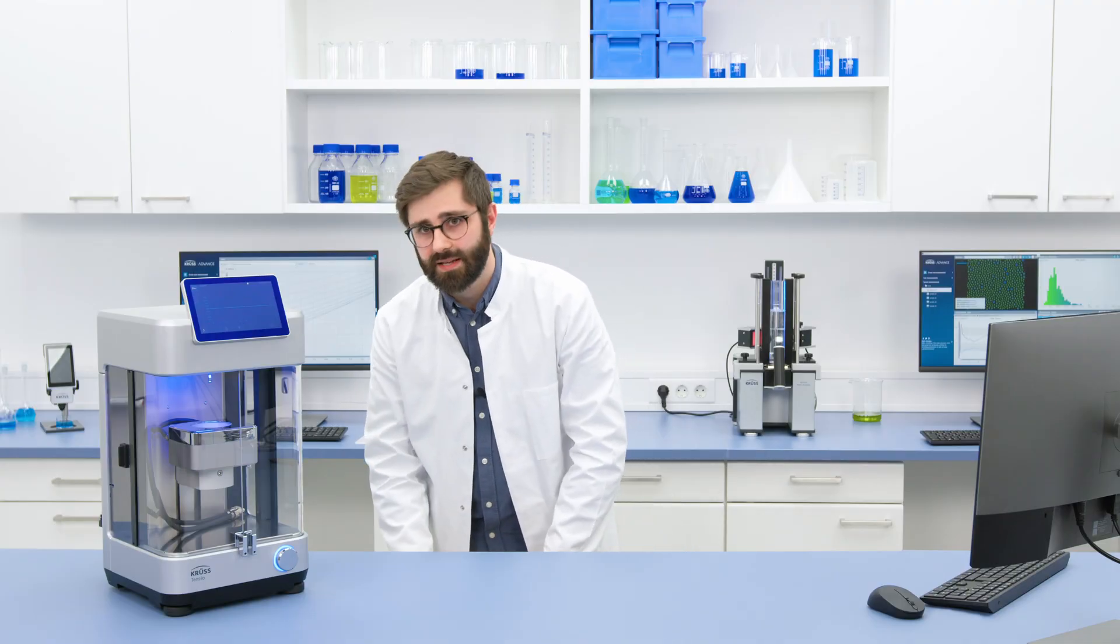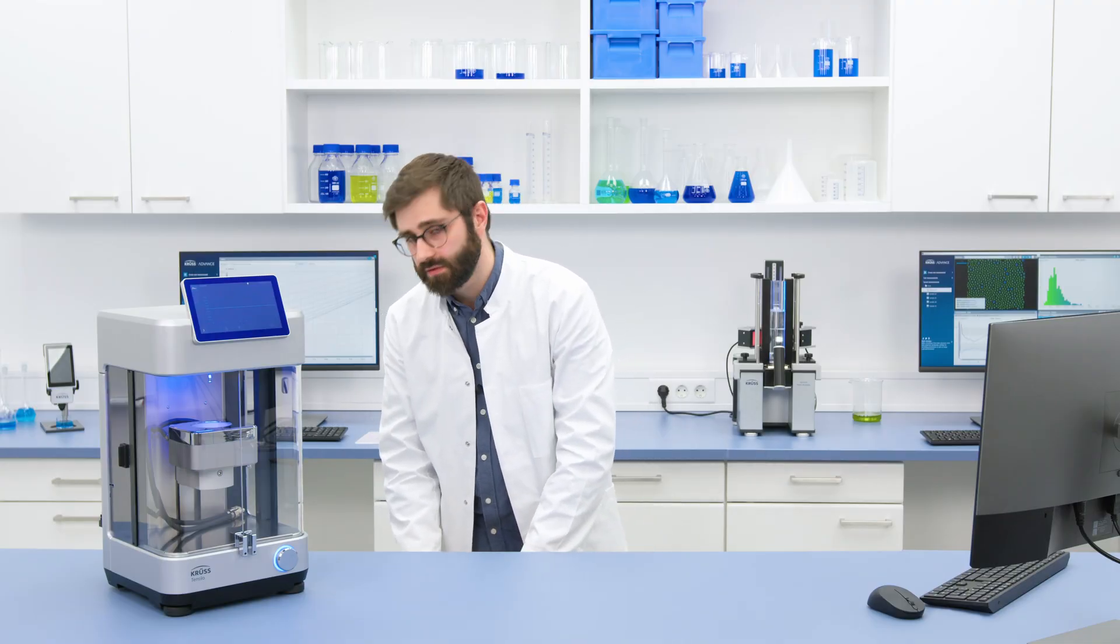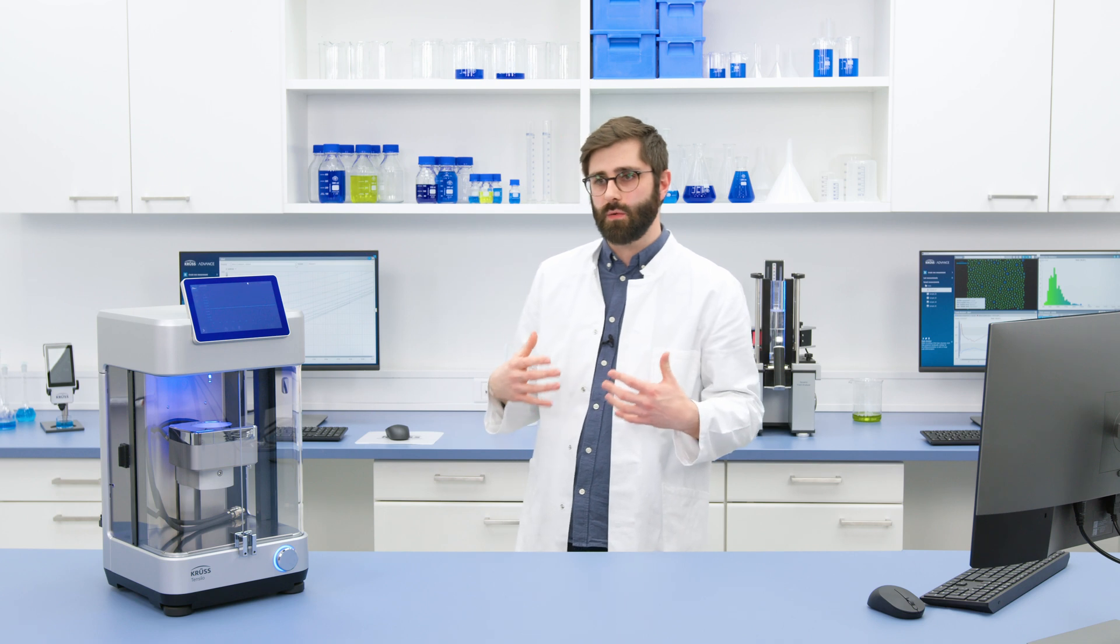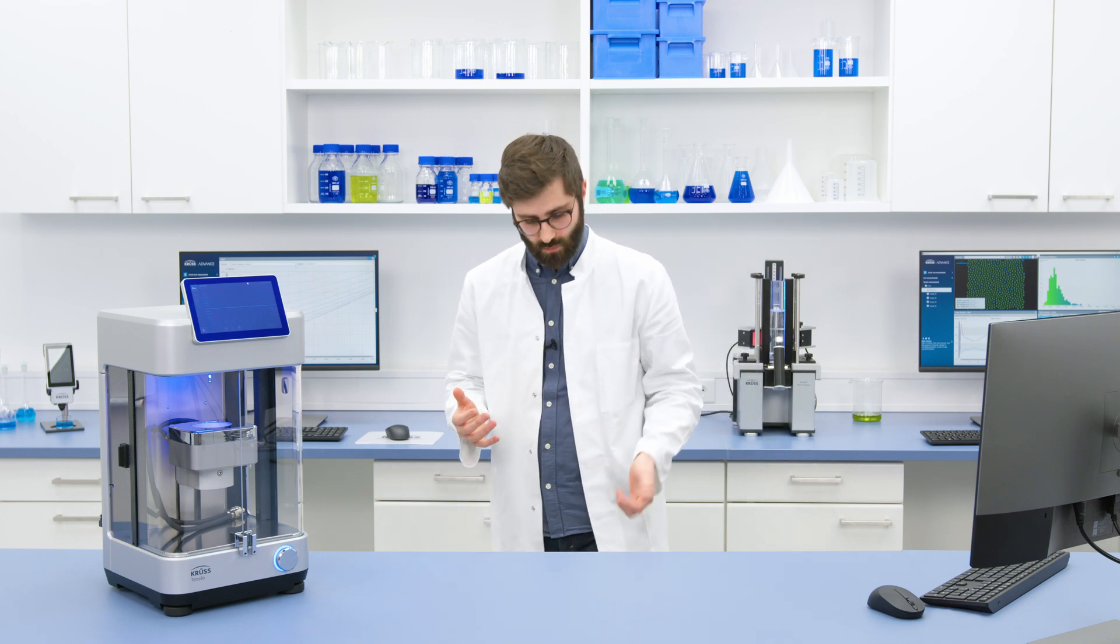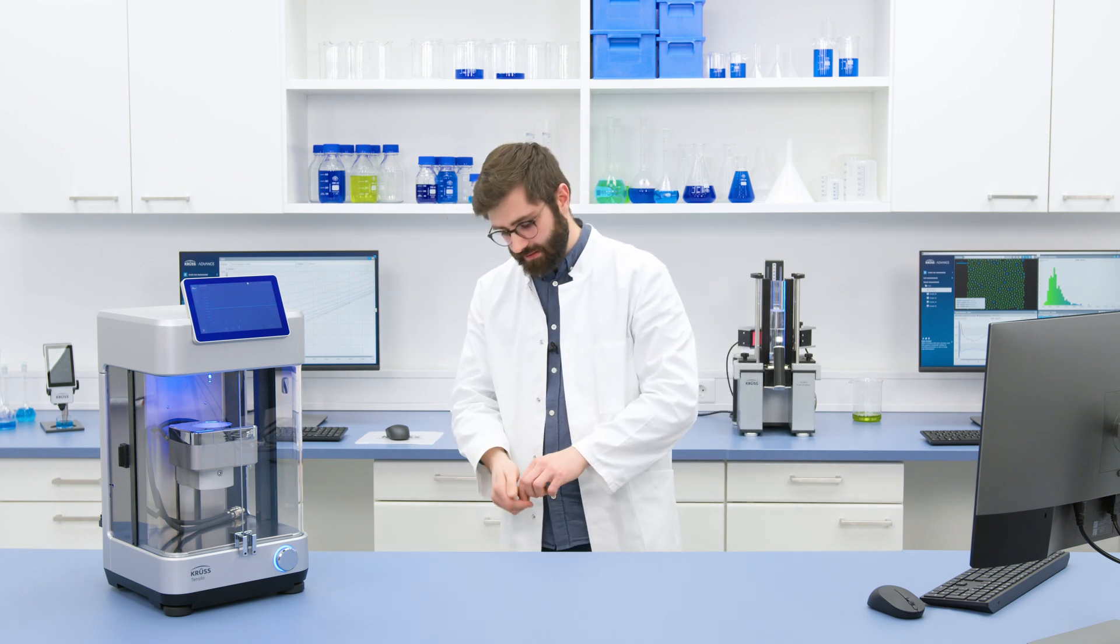There's also a wide selection of different attachments that give you access to different kinds of measurements. So we can take something like this.